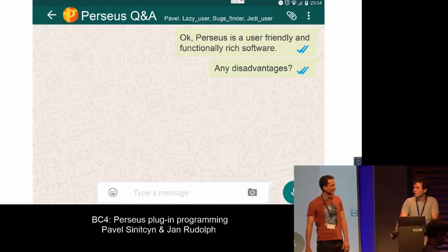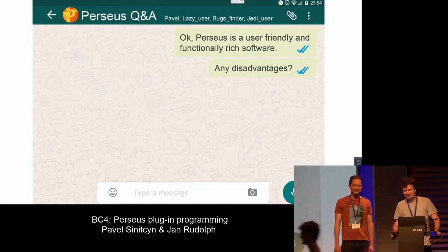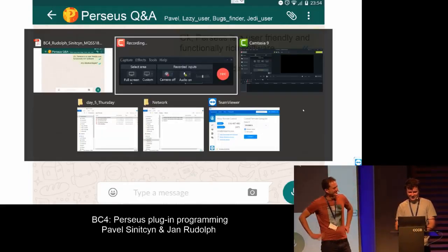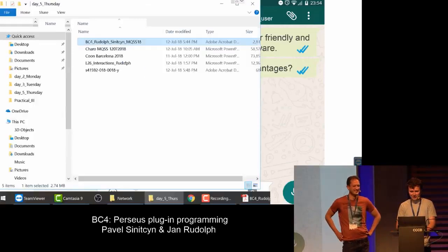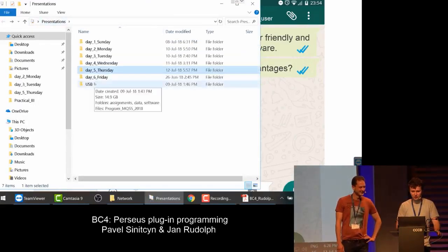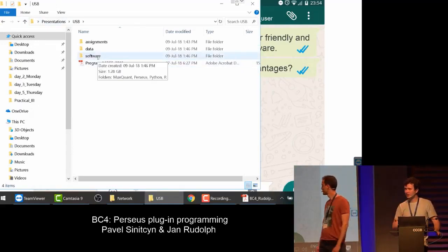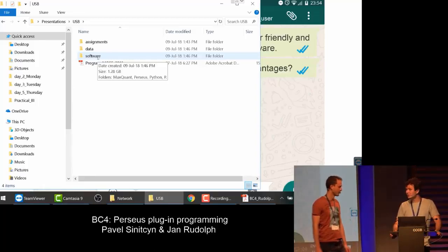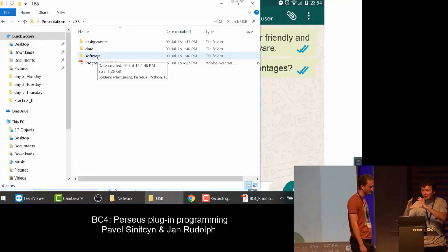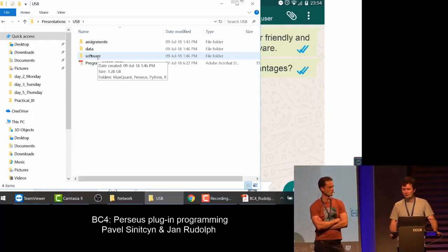Sometimes the window is way too small. Basically, in most of the buttons and activities, you can change the percent and zoom it in. But it's a really tricky thing. We're trying our best, and even Eugen has a small computer and a huge computer in the office with the single purpose of testing with small and big screens.